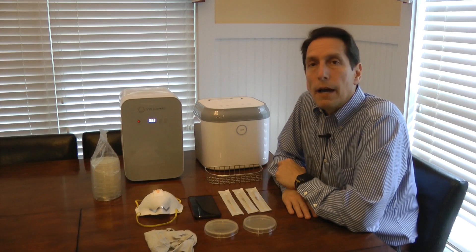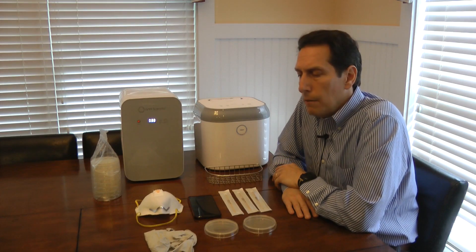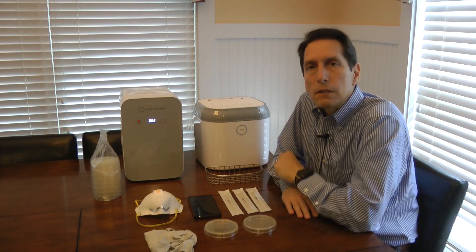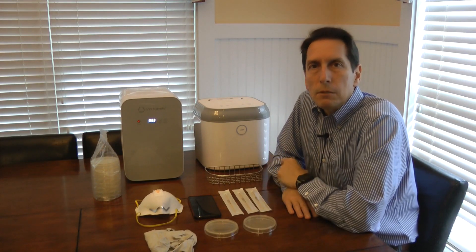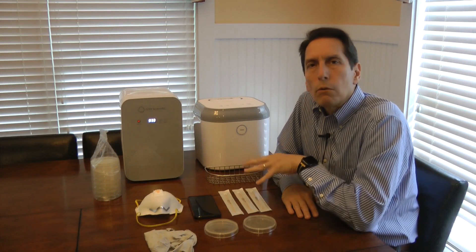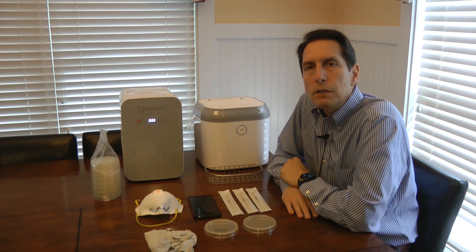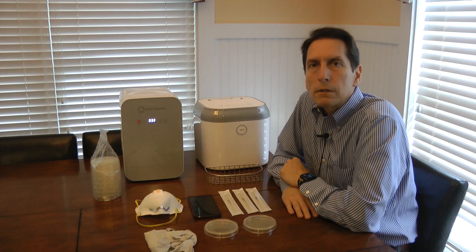Now, I should say that we're working with bacteria out of convenience. The COVID-19 pandemic, of course, is virus driven, but it would be difficult to show that on a video. While there will be viruses on these dishes, we wouldn't be able to see them with the naked eye — we'd have to use a microscope. So we're going to work with bacteria, which should make it much more obvious how much growth there is between the two petri dishes, making for a better experiment.